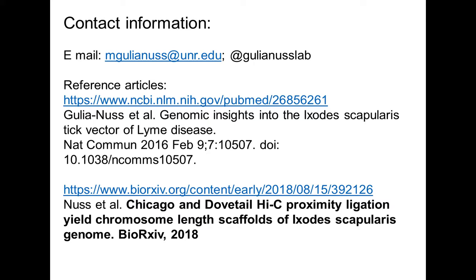So the second option is that we would recommend improving that input N50 by adding more sequence data to the draft assembly. For example, if you used strictly Illumina sequencing for your input assembly, we might suggest using a longer insert and doing more short read sequencing, or even better, adding some long read sequencing like PacBio or 10x Genomics or Oxford Nanopore, to get that initial N50 above the 20 kb threshold, at which time we can go into this Chicago pipeline.